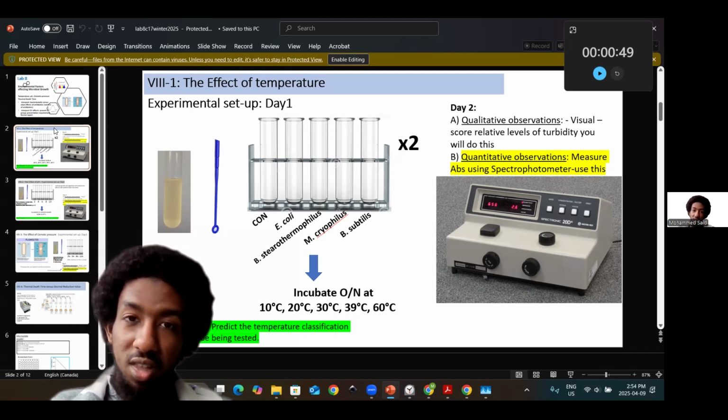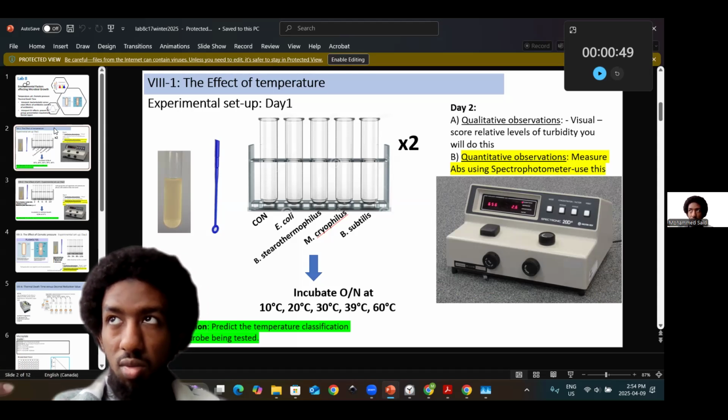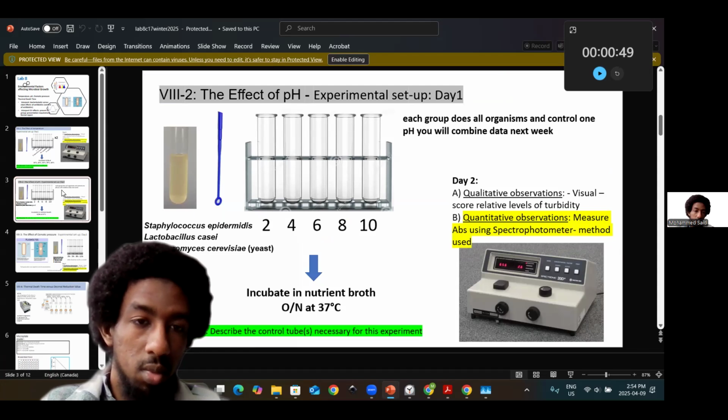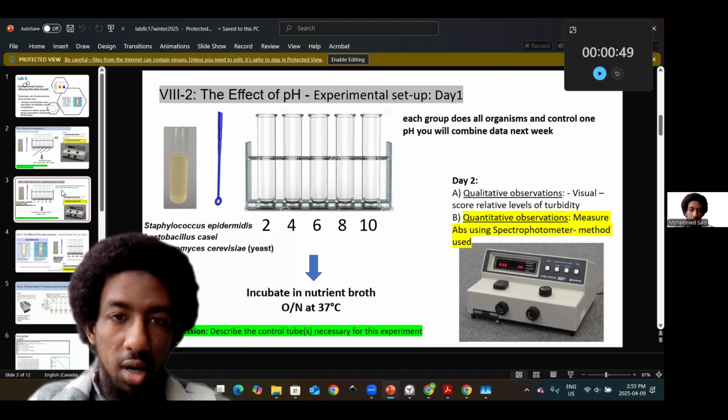And that also reflects their turbidity readings that you would expect over time. So think about those different conditions and assume that you're looking at them for a finite amount of time, because technically over, let's say, 48 hours, all of them may have reached a very high turbidity, and absorbance readings may not necessarily discriminate them quite readily, which is something you want to consider based on your results from our former week 8. So bear those details in mind.